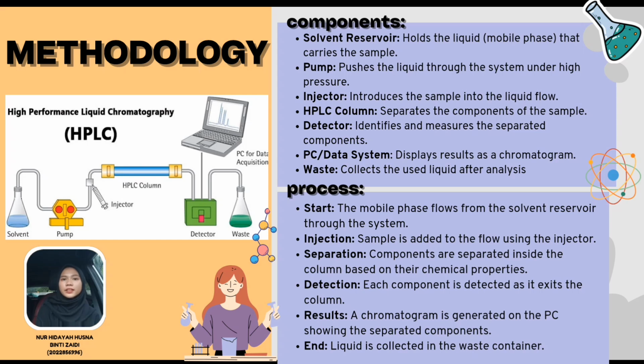Number 5, detector. After separation, the components are detected and measured. The detector converts this into a signal. Next, PC or data system. The computer processes these signals and produces a chromatogram to help identify and measure the components. Finally, waste container. The liquid leaving the system is collected in a waste container for disposal.